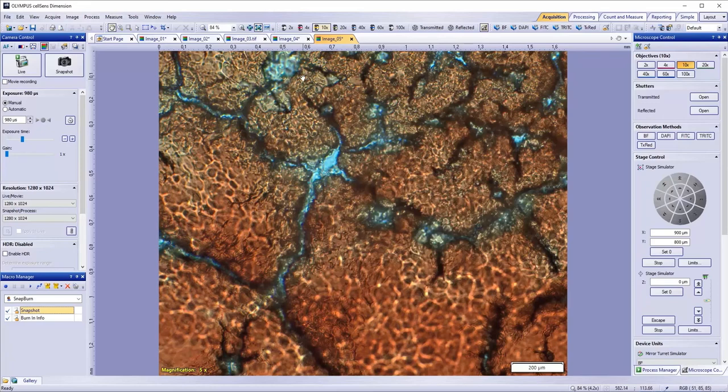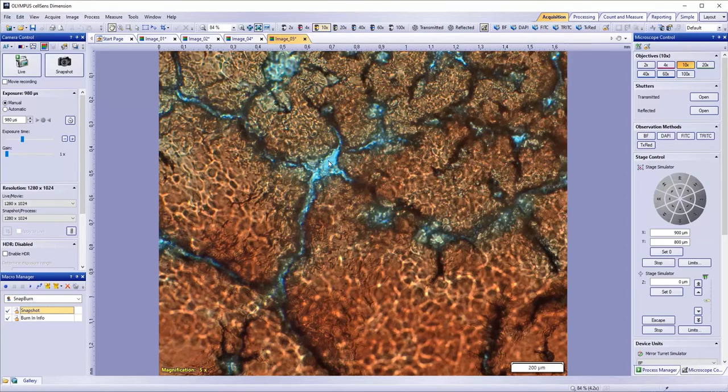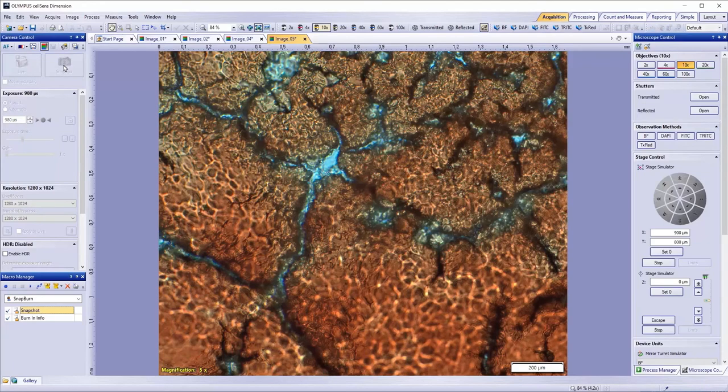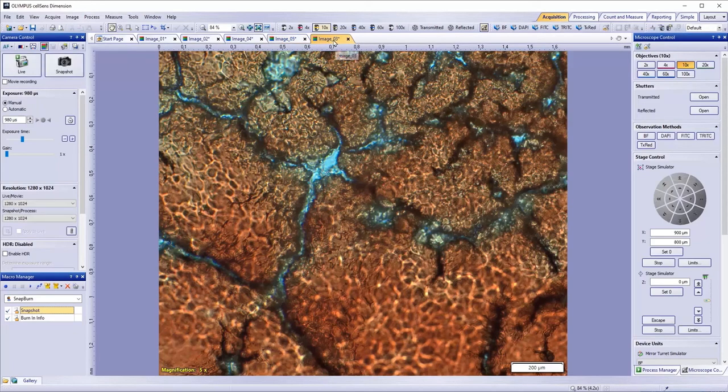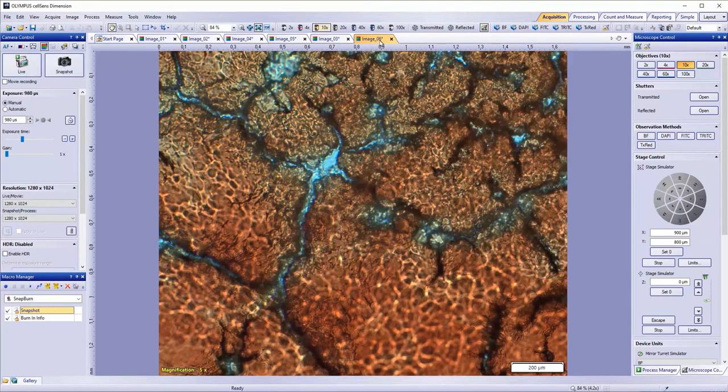Here's an example. I have five images open, and I'm going to delete image 3. Then, when I click Snap, you can see that the next image is image 3. And if I snap again, the next image is image 6.